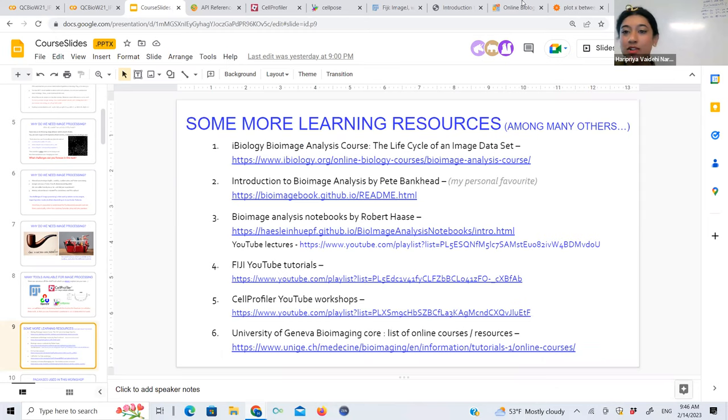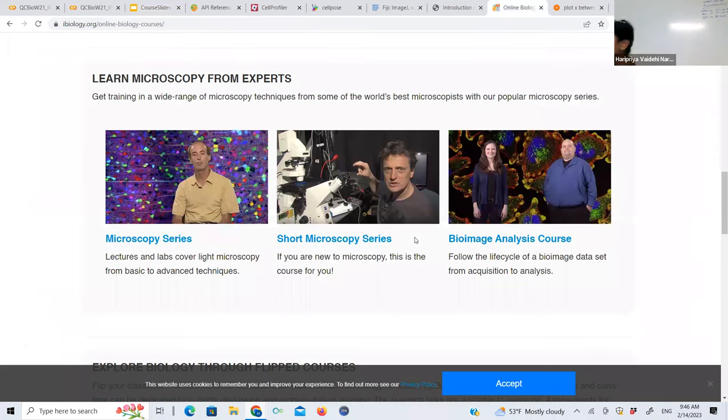And two of these I wanted to point out that I really, really like. This is the iBiology website. It's put together by Ron Vale, who's a really famous cell biologist from UCSF. And it's a collection of resource videos that are completely open and free, meant for your learning. They have a series on microscopy where they explain everything from the parts of a scope, how an image is formed, to how you can take apart your fancy Zeiss scope and actually put it back together and get it to work perfectly.